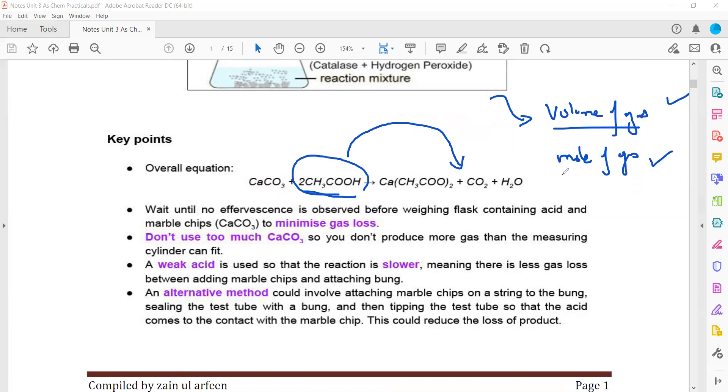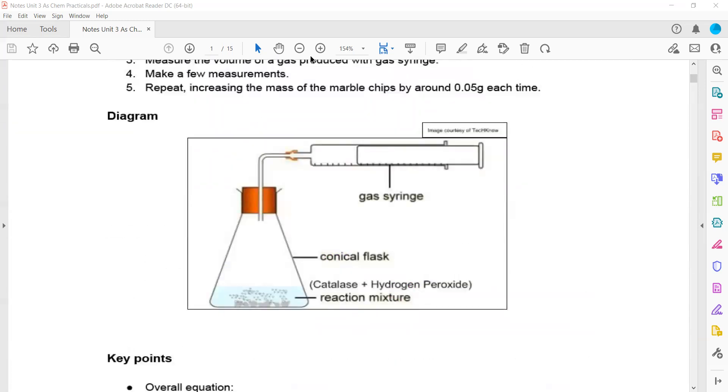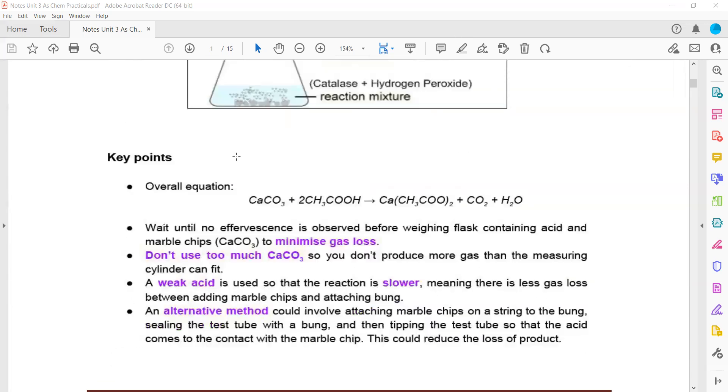Key points: Wait until no effervescence is observed before weighing. Don't use too much CaCO₃, because if too much gas is produced, it might exceed the maximum volume the gas syringe can measure, making the results inaccurate.